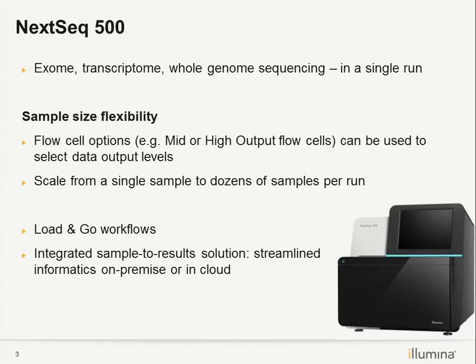So that's analysis. Do we get any chance to try that analysis on a local server? Local server, no, because the app is on the cloud server. There is no local software for this app, unless you use BaseSpace Onsite. BaseSpace Onsite is a server with inbuilt apps like what we have in the cloud, but it's not connected to the internet. You can ask for a quote. So can we try this one?